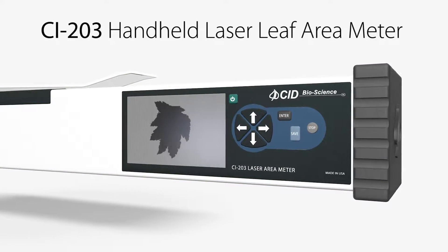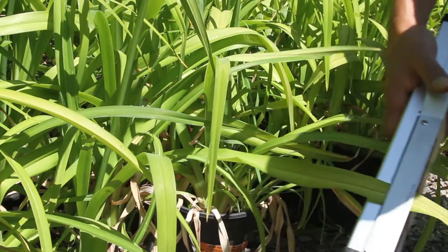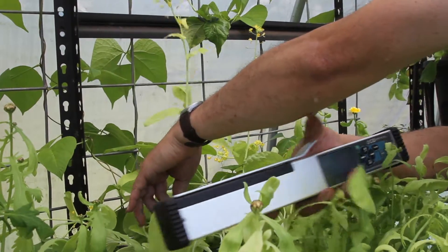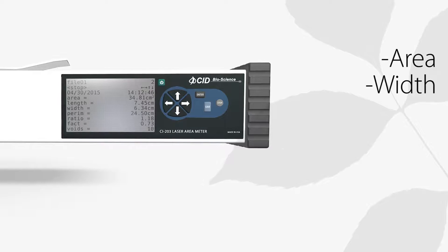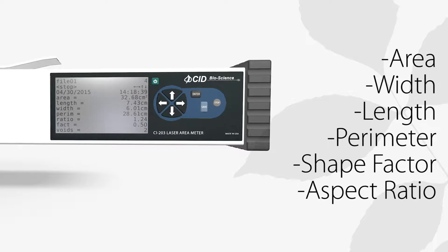Thanks to the CI-203 handheld laser leaf area meter, the study of long and thicker leaves has never been easier. Researchers can perform non-destructive measurements of leaves of living plants by sweeping the leaves through the measuring wand and instantly scanning and calculating the leaf area, width, length, perimeter, shape factor, and aspect ratio.